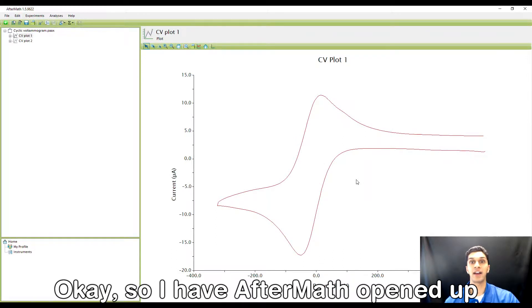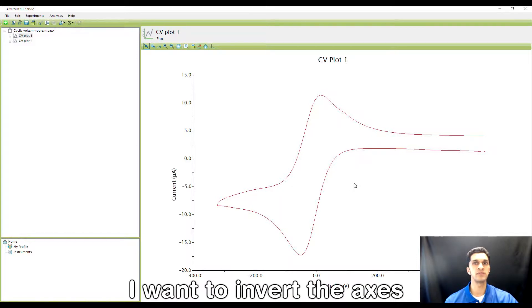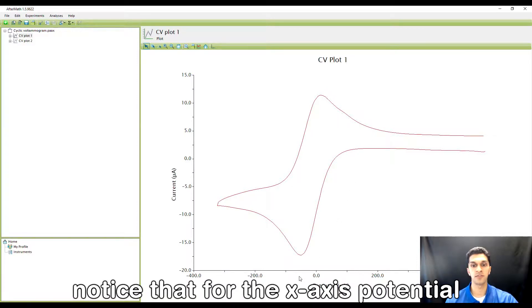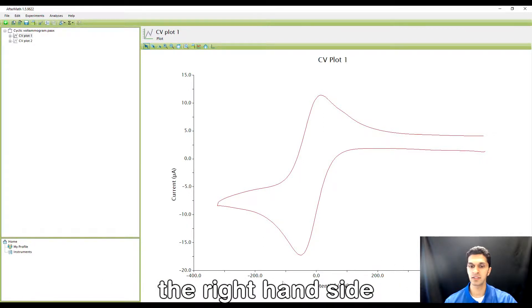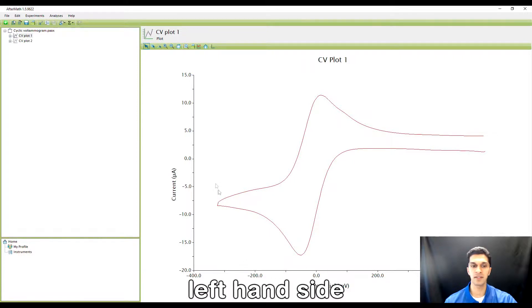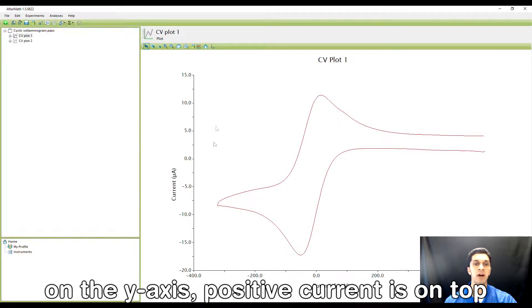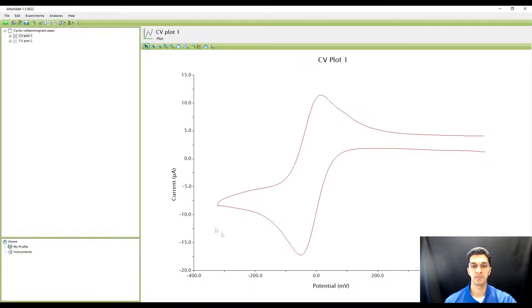I have Aftermath opened up and I have a cyclic voltammogram plotted. I want to invert the axes. Notice that for the x-axis potential, positive potential values are plotted on the right-hand side and negative potential values are on the left-hand side. On the y-axis, positive current is on top and negative current is on the bottom.